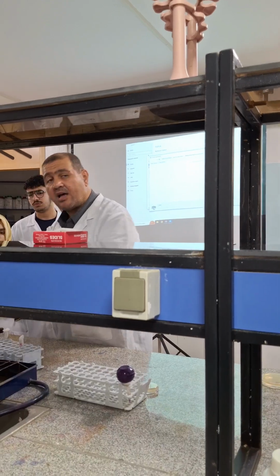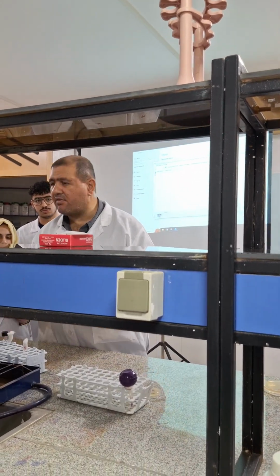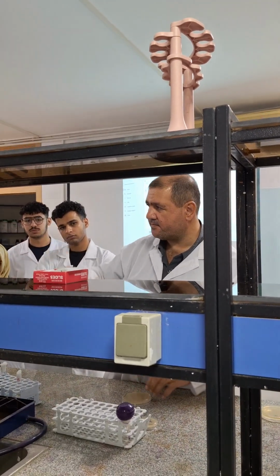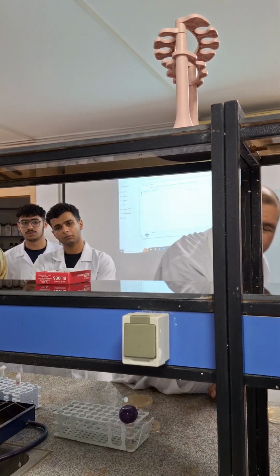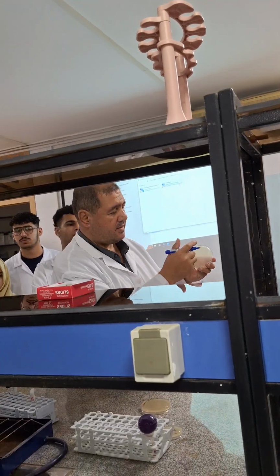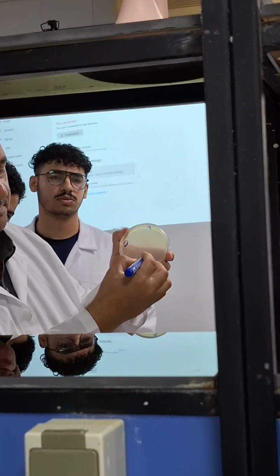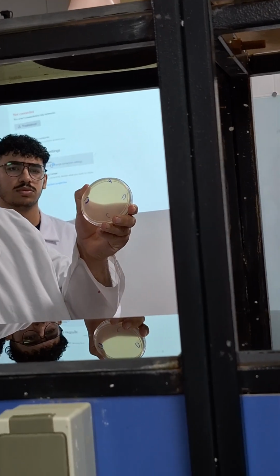To culture on a plate, divide your plate into 4 sections. Give me the CD marker. A, B, C, and D.